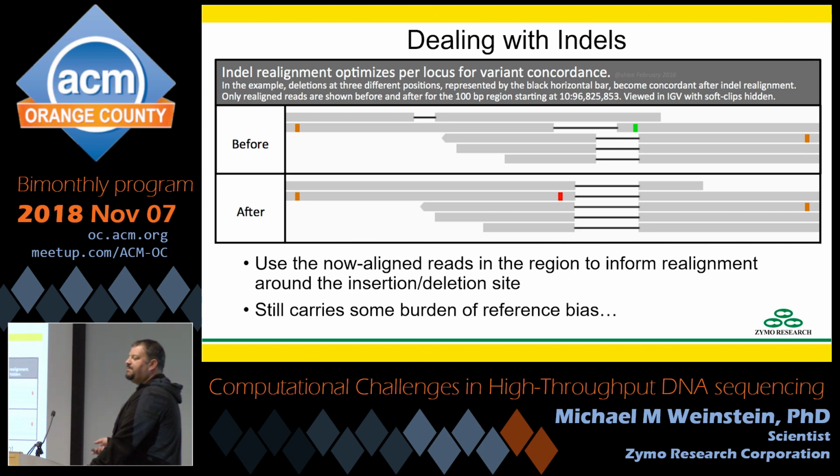This isn't a complete improvement because this still carries a certain amount of reference bias burden. Or in other words, I'm going to be biased here by what the reference genome is, which we know this person doesn't have reference. So I'm going to try and match the reference.